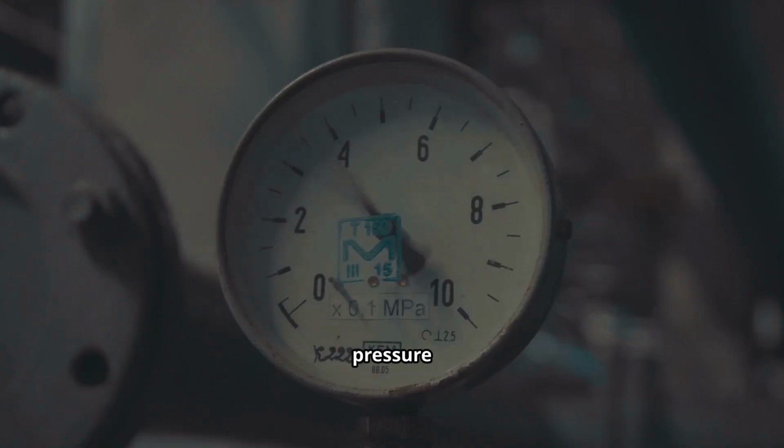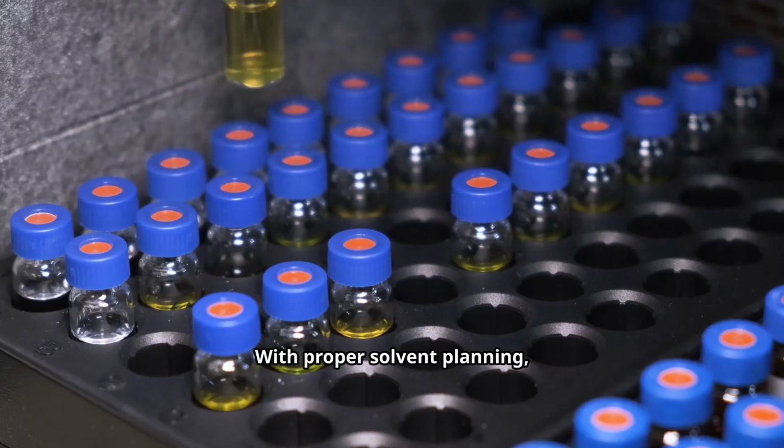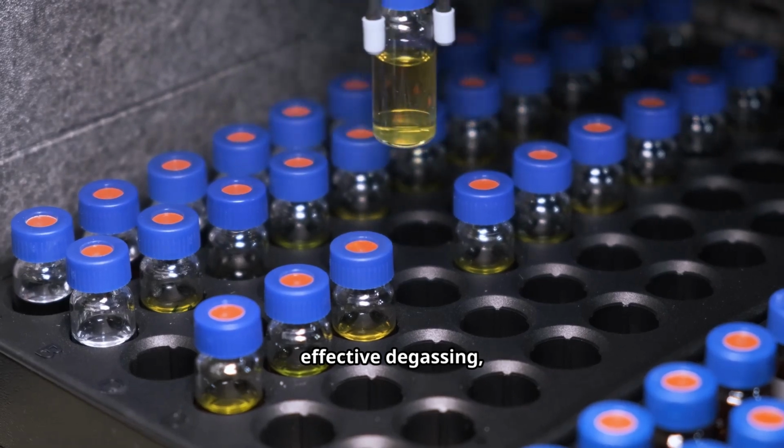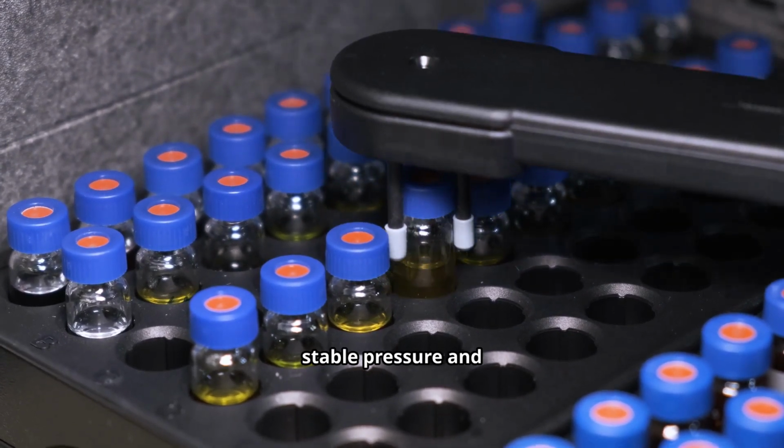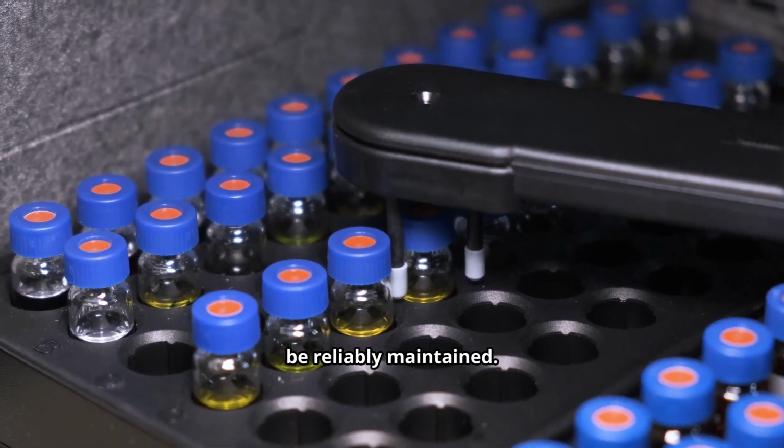In summary, pressure fluctuations in HPLC are most commonly caused by poor mobile phase degassing and air ingress into the pump. With proper solvent planning, effective degassing, thorough priming, and routine preventive practices, stable pressure and reproducible chromatography can be reliably maintained.